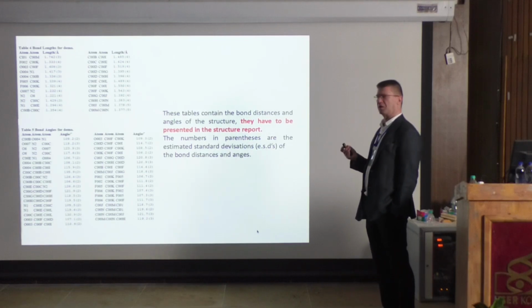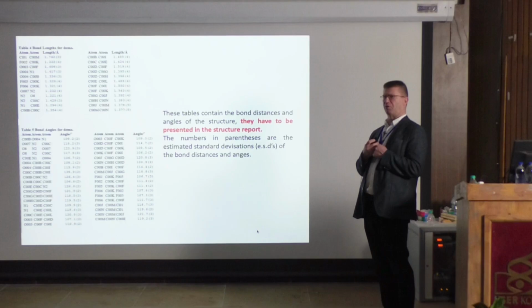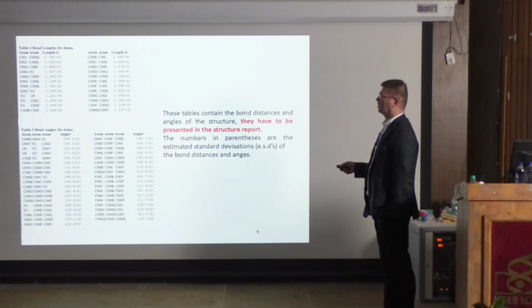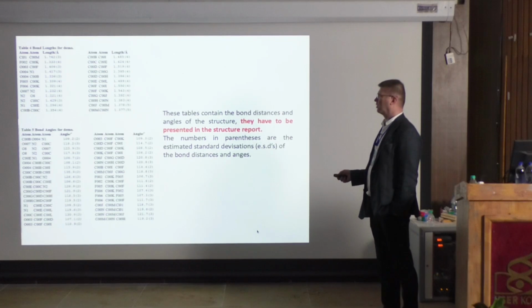So this is what we can extract. We will extract a lot of information, but we also have to look critically at the information we have. So that is printed here. We can see the nitro group distances are clearly shorter than carbon-carbon or carbon-nitrogen bonds.